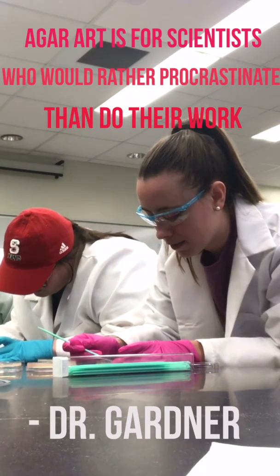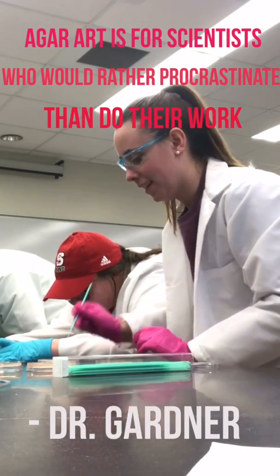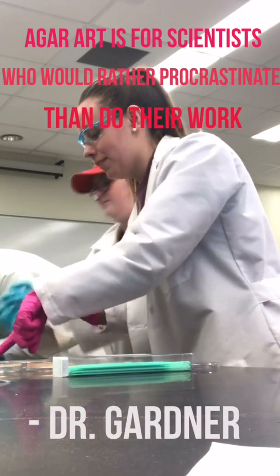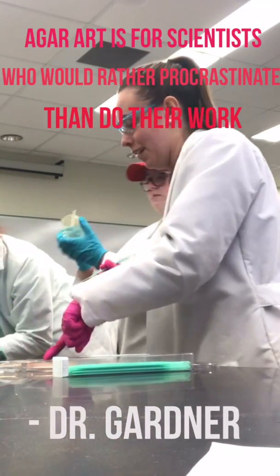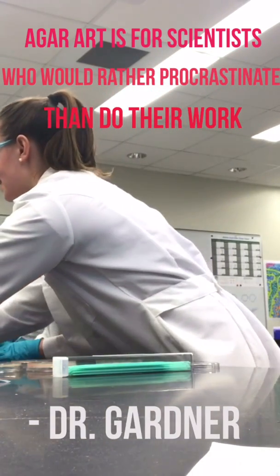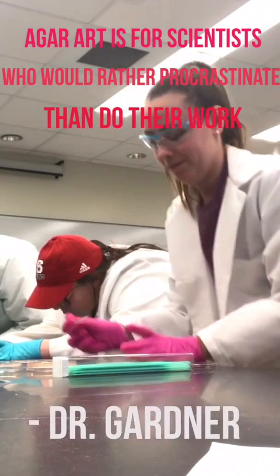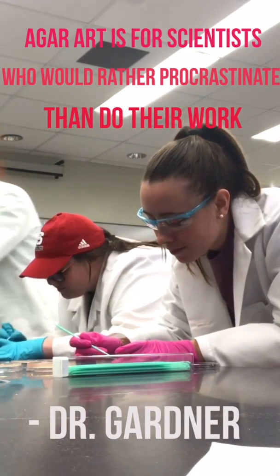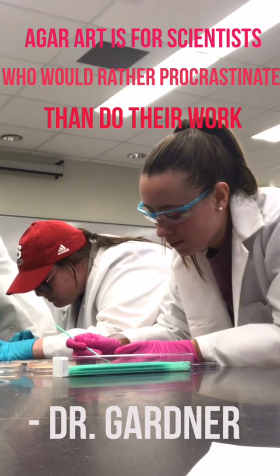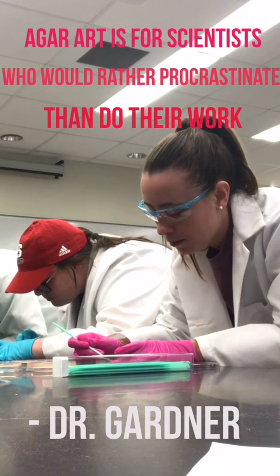Hey Kim, with your M, are you doing the whole detail? No, I'm doing the inside, like this one. Okay. See, she has one that is filled in, one that's not. I think that's gonna be easier. Yeah, it's not easy doing the edges. And then the beautiful thing about Serratia is that we just leave them out on the bench and they grow at room temperature.